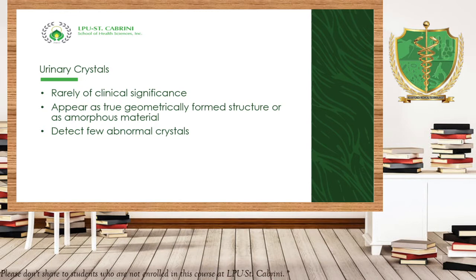Sometimes, hindi po sila napapareport. Kaya po, akala yung result ay simpleng urine or simpleng renal disorder lang. Okay? So, if you will be a registered medical technologist working in the urinalysis section, then please examine your urine sample accordingly.